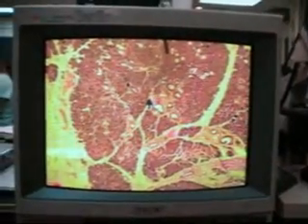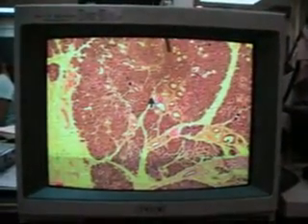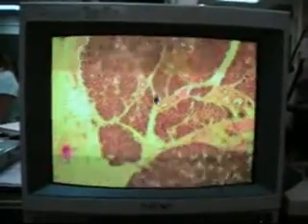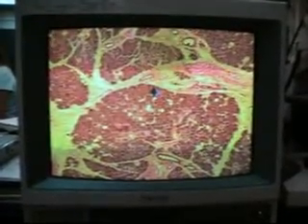Haha. You always do. Well, I'm sorry, I just can't get this microscope to focus, but I'm going to give you a quick look, and then I'll come around to your scopes because you can probably make yours a little bit better. I don't know who misaligned this scope, but when you have 7 or 8 people using it, you never know what's going to happen. Okay?